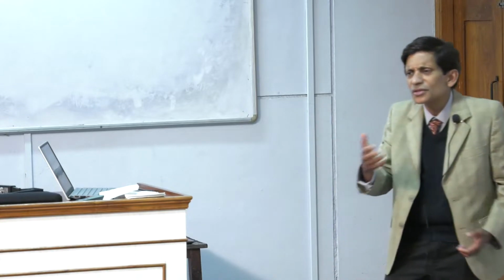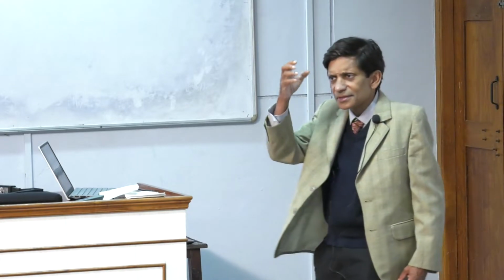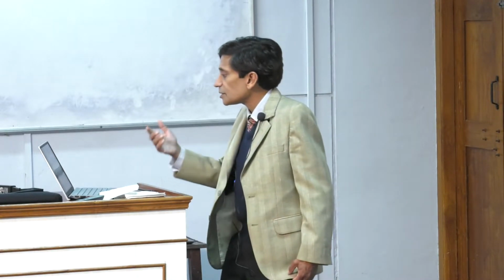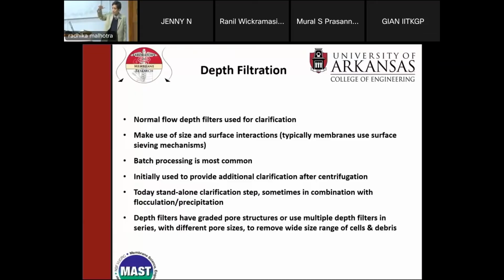So if you're working in water treatment, it's like sand filters, right? So with sand filters, you absorb stuff all the way through the filter, okay? And as I said here, you have a graded pore structure, so you can start off with pores of different sizes, larger pore size moving to smaller pore sizes.